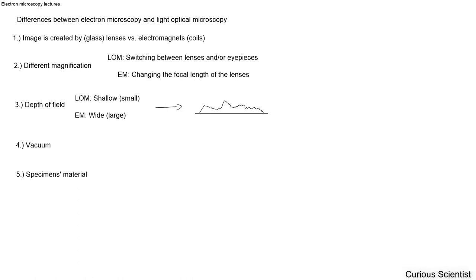We basically learned about the general structure of the electron microscope, why we need it and how we use it. And in the last few lectures I was comparing the different electron guns and their purposes and their lifetime and so on. So at this point we know how to generate the electron beam which is needed for the imaging, but we don't really know what happens to the electron beam after it leaves the electron gun, the source. So in this lecture we will tackle that question.